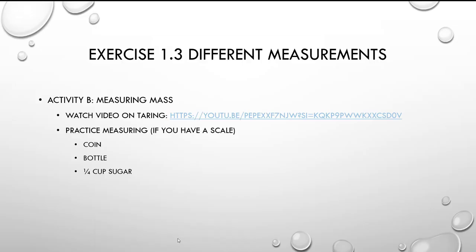She's the person that developed the course, so you'll see a lot of her, or hear her voice a lot, in the YouTube videos. You'll watch her practice using an electronic balance, and you'll see her use what's called a boat.